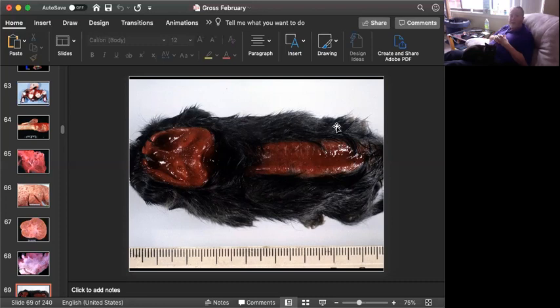So we've lost the cerebrum, at least, and possibly more. And we have also lost, at least this segment of, the spinal cord. Is this spina bifida? It is certainly as bad a case of spina bifida as you would want to see. I think that rachischisis with amyelia probably covers it pretty well.